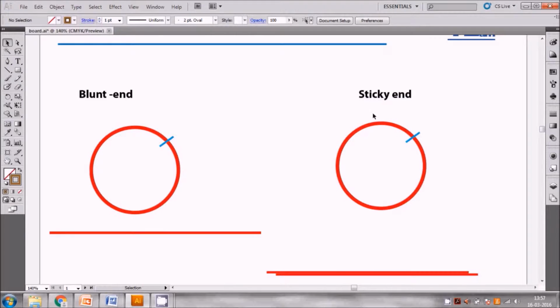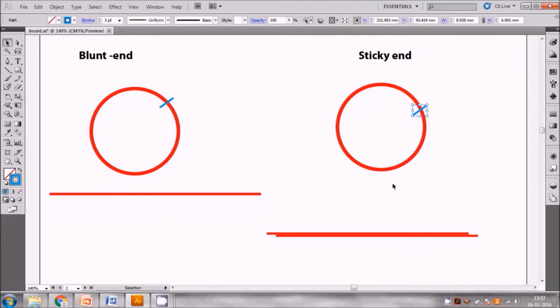On the other hand, I will explain the sticky end. For example, take the same plasmid, and an enzyme which creates a sticky end has a cutting site here. How will the sticky end look after cutting? You can see that there is some extension. If it is double stranded DNA, one strand will cut here and the second strand will cut like this.